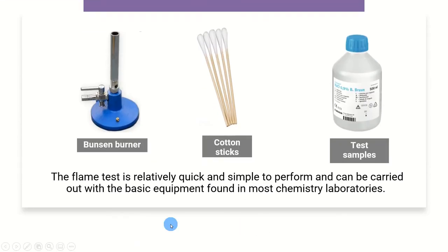Flame test is relatively quick and simple. We can do this quite quickly in the laboratory. All you need is the Bunsen burner, some cotton sticks, and of course the test sample.